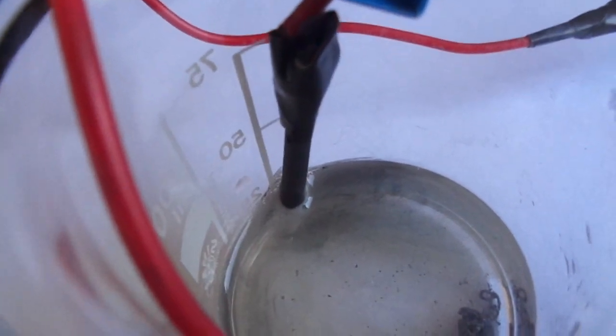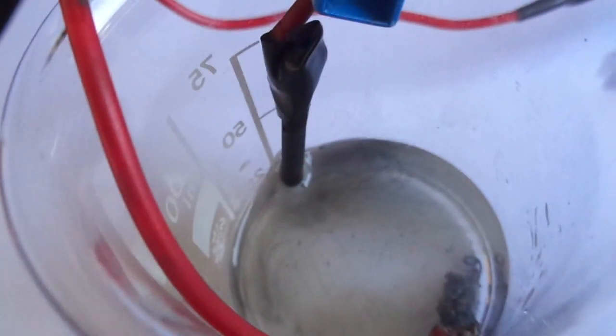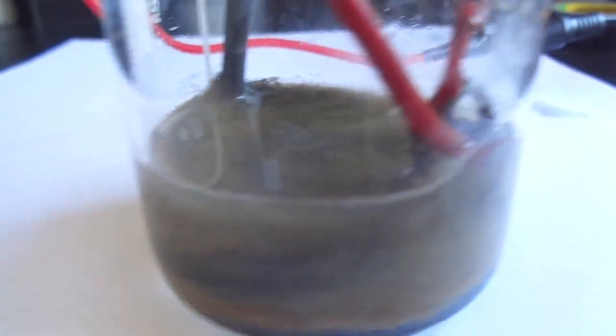You can also see that there is that kind of black solid floating around and that's our silver oxide. Let me stir the solution a bit. Look, there's a lot of that silver oxide.